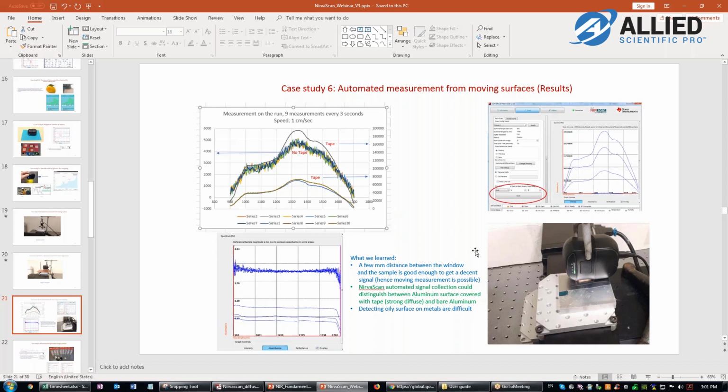Okay. Yes. Do you have any examples of an organic material which would be coated on an inorganic material? I'm thinking more of applications like asphalt, coated rocks. Do you have any application like that? Yes, for rocks, actually, I do. I have looked at some mineral rocks. There are some rocks that are fluorescent.